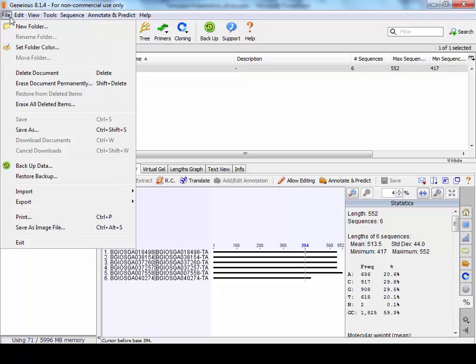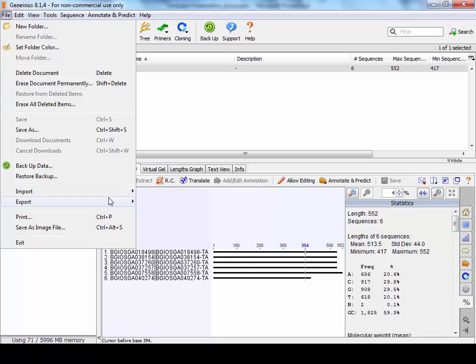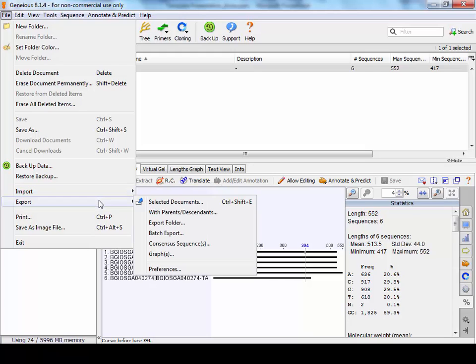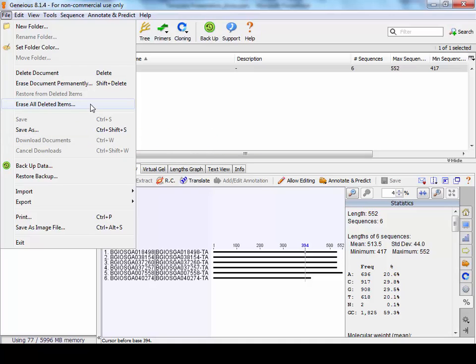What we have here is a number of options for you to play with. The most obvious ones are import from file. So if you want to import in data, you can drag and drop, but import from file also works. And if you want to export, you can export selected document, export folder, and then reload it into another Geneious instance or just use it as a backup.